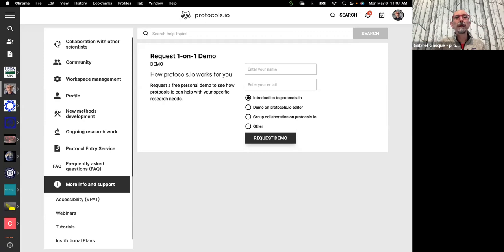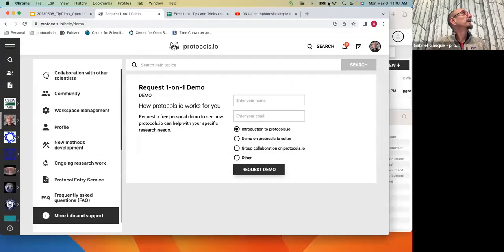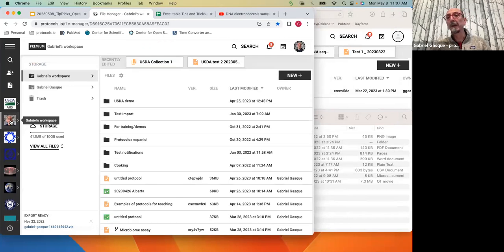So the first topic that I want to cover is how to bring into the platform existing protocols. I'm going to minimize my presentation here, and I'm going to go to my workspace just to orient ourselves.